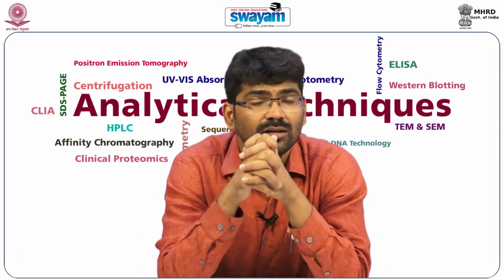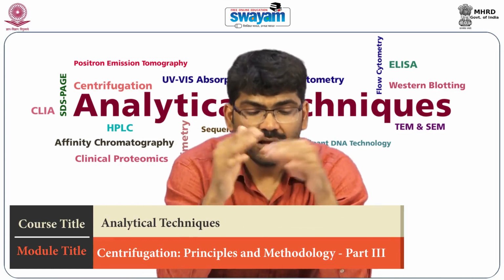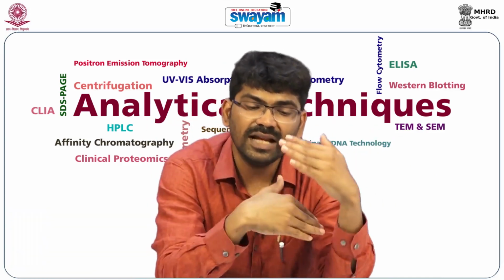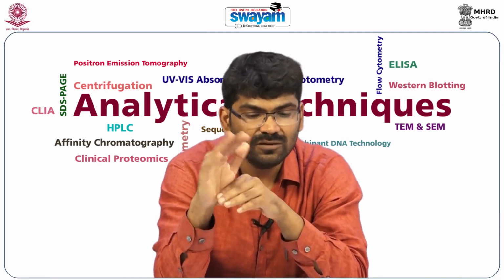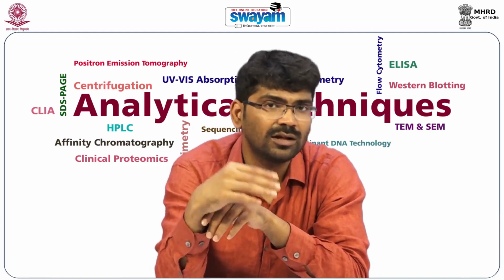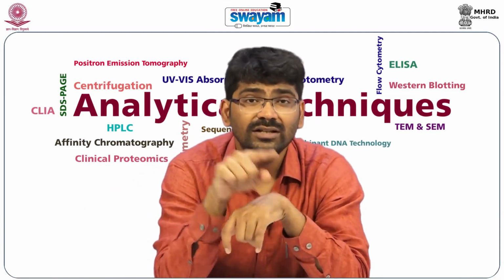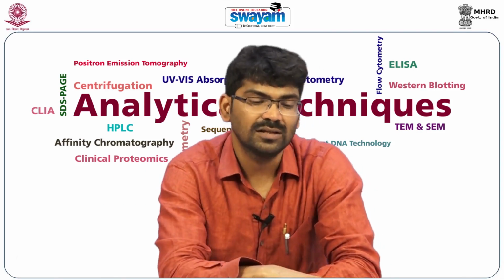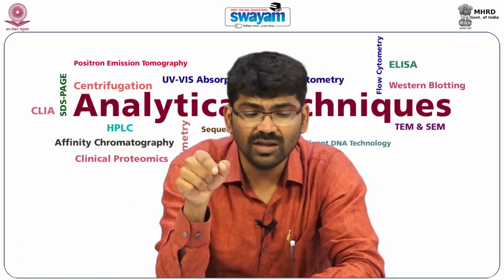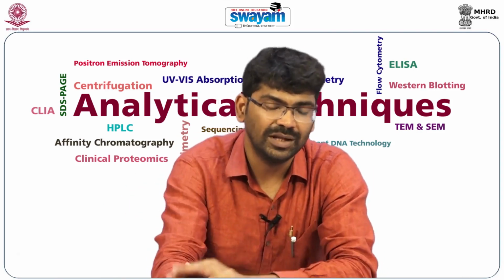Now, the centrifugation process is of two types: differential and density gradient centrifugation. Differential centrifugation will be taught by Dr. Amarpreet in another lesson. I will teach you density gradient centrifugation in an upcoming lesson. Density gradient centrifugation is again of two types: rate zonal and isopycnic.